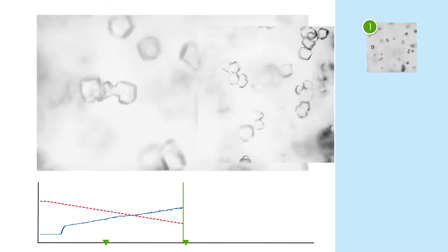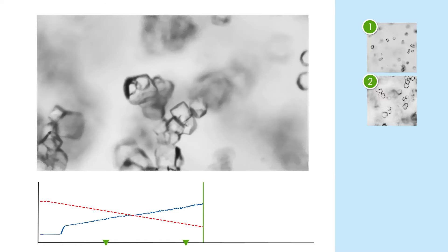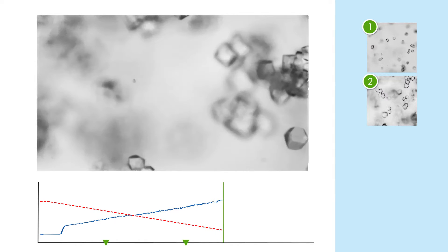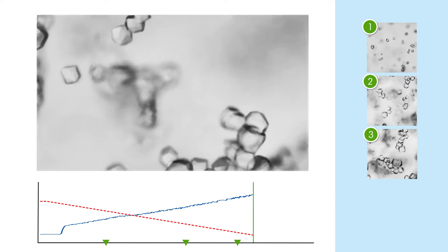Over time, the agglomeration continues with few individual crystals observed. Instead, long chains of agglomerates form, likely trapping impurities as they do so.